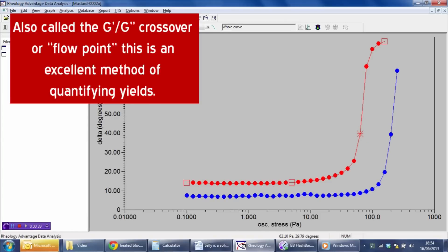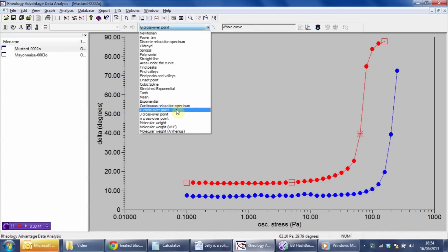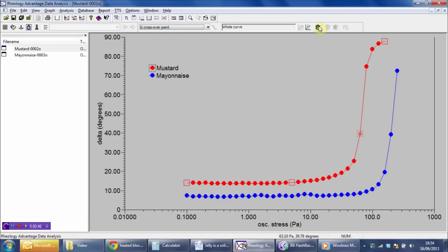And it's really easy to do that in this software. You click on the curve, and from this box of available analysis here, we select what we call G crossover point. We hit the traffic light, and the software will report our interpolated yield stress value. It's coming in here at 69.49 Pascals for the mustard. Let's do the same thing for the mayonnaise. The mayonnaise is coming in at 217.1 Pascals, significantly higher than that of the mustard.